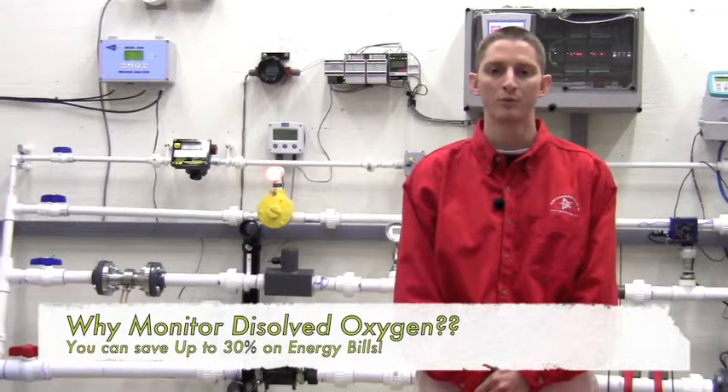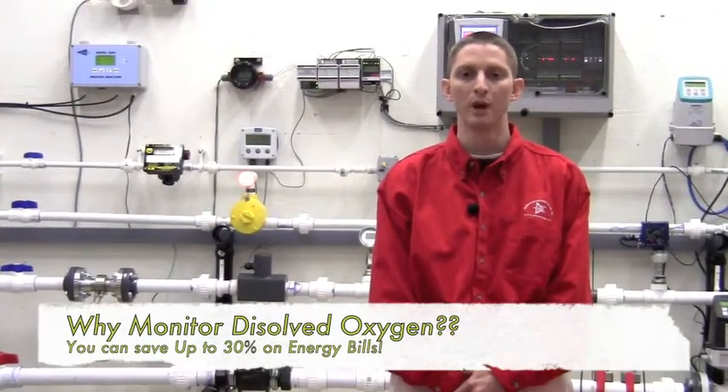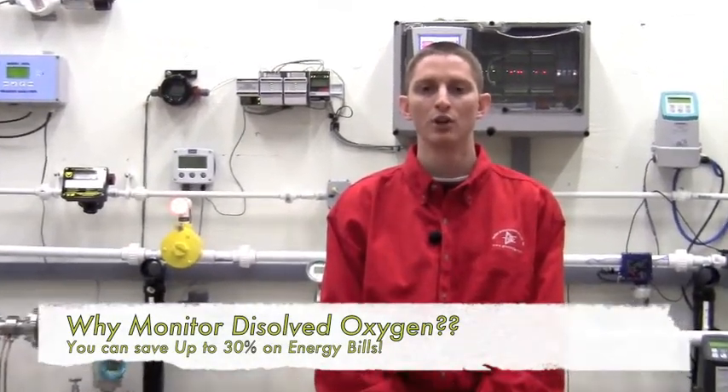Monitoring for DO is important because it allows you to control the amount of oxygen to your blowers, thus greatly reducing your energy bill — sometimes by up to 30%.